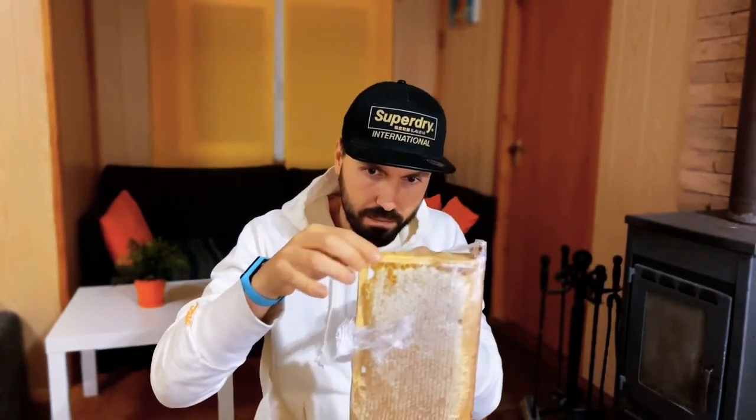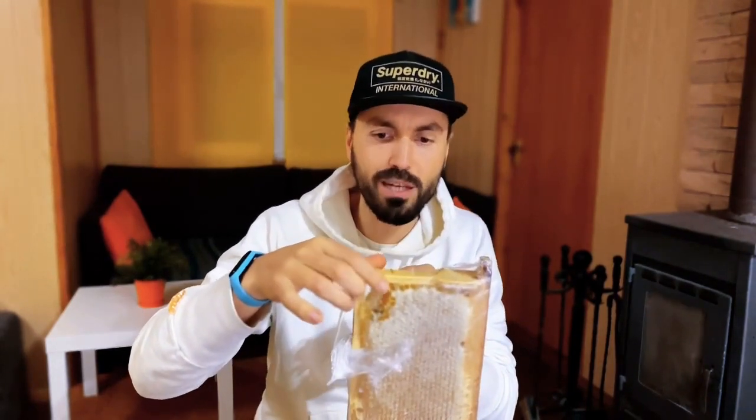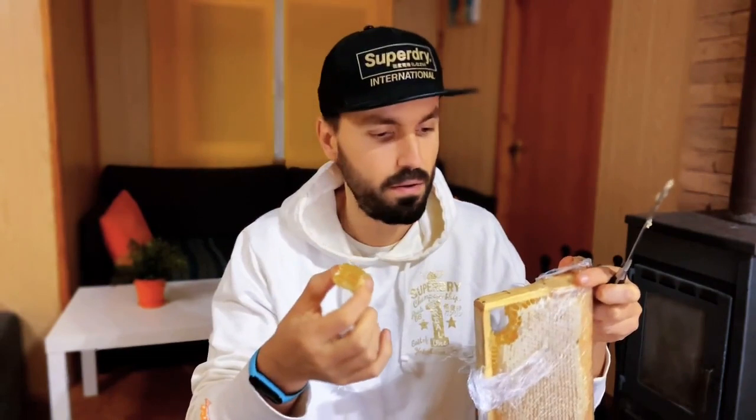As usual, I will measure my blood before eating this honey — like real organic honey. I will eat the honey and measure again after that, but that will be tomorrow. Today I will just try one piece to understand the taste.